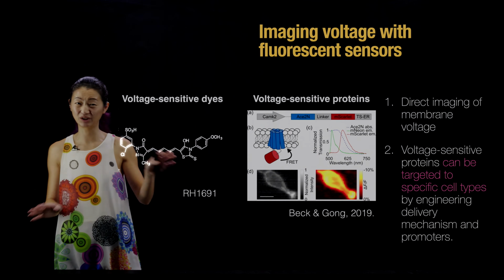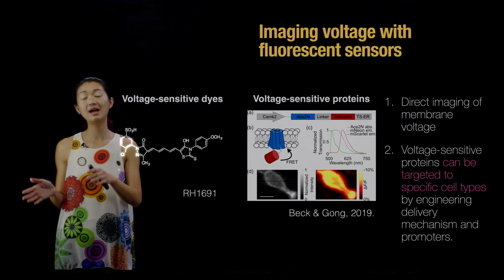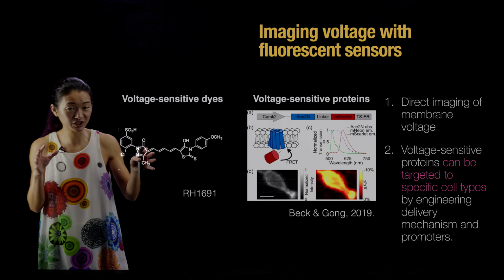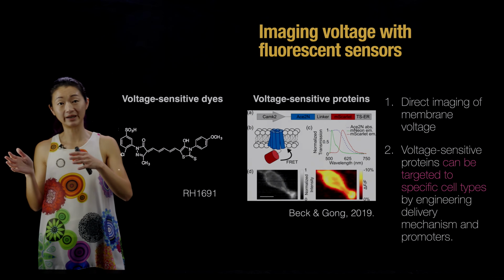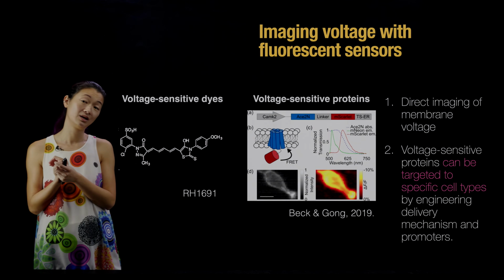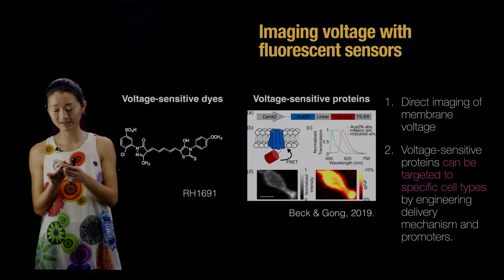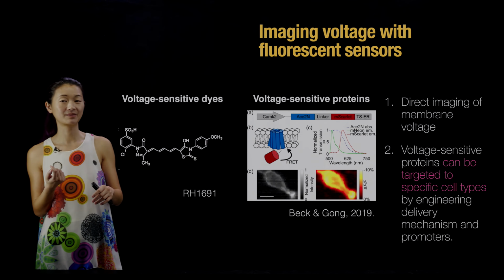They're a similar concept to the calcium imaging, except these are sensitive to voltage changes directly as opposed to changes in calcium. Like we talked about, with the calcium sensors we were using calcium as a proxy. So you were never actually measuring the membrane potential. You're measuring a proxy of the membrane potential because it is correlated with the influx of calcium. This has a couple of downsides. One, calcium has its own dynamics, right? So you're kind of measuring that, not the neural activity itself. And the second downside, and this is a perpetual worry in everyone's head, is that calcium is being used as a second messenger in the cell, which means it has a function, right?